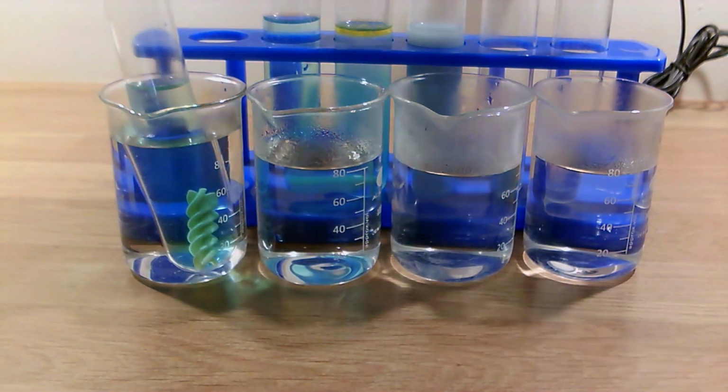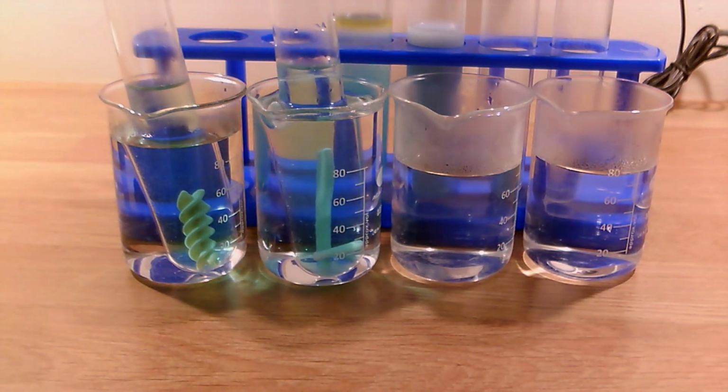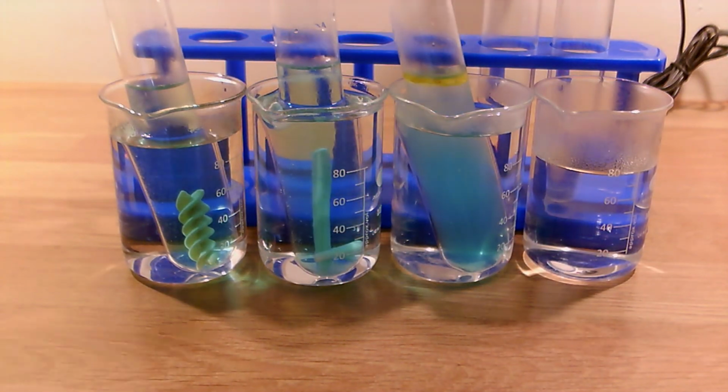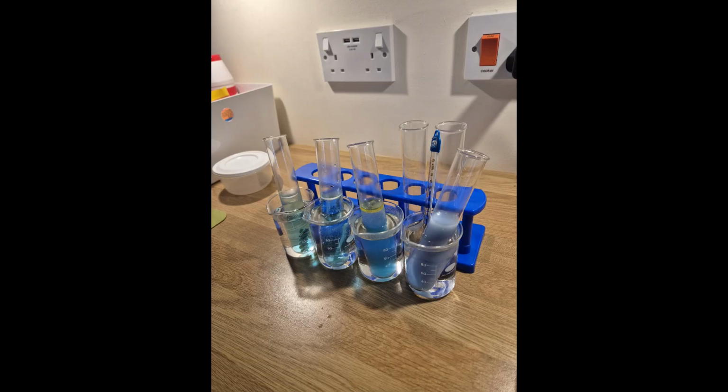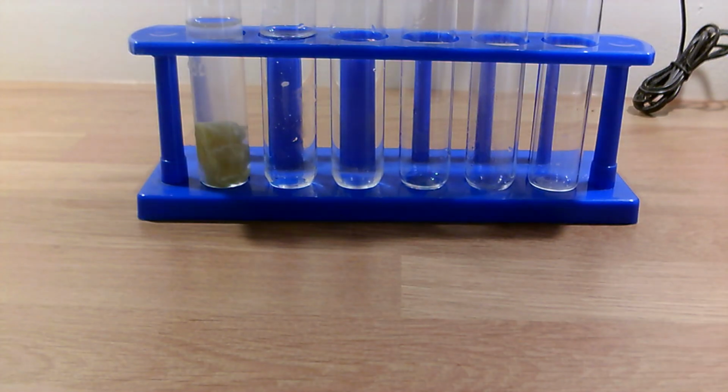You can see the colour of the Benedict reflecting in the water. You can also see lots of bubbles of Benedict rising up inside of the test tubes. None of the foods have changed to the colour that they should change to if they contain glucose, but the milk has gone purple. But we think that is because the milk is white and the Benedict is blue. We weren't expecting anything to happen when we did this test with these foods.